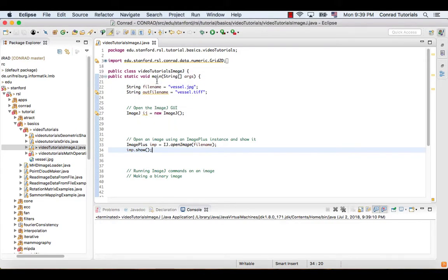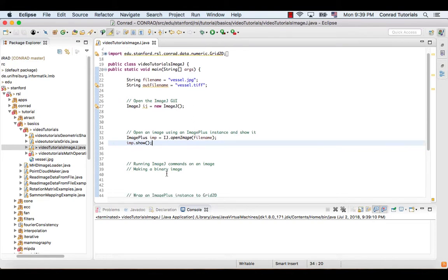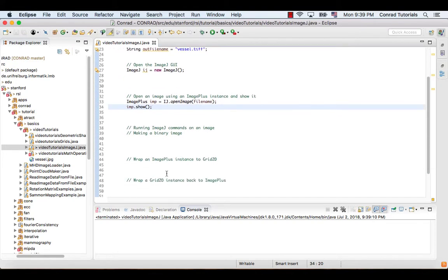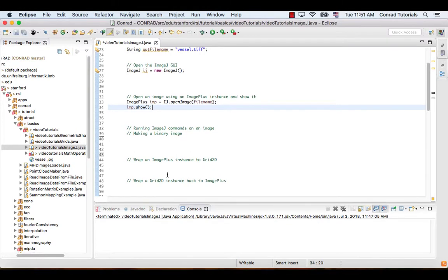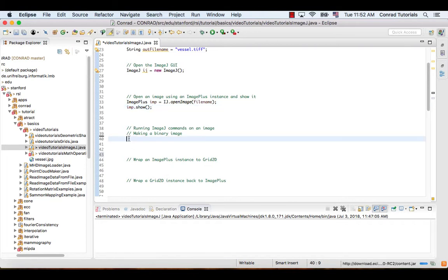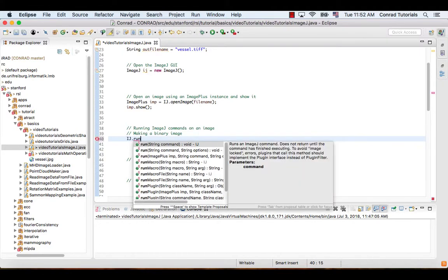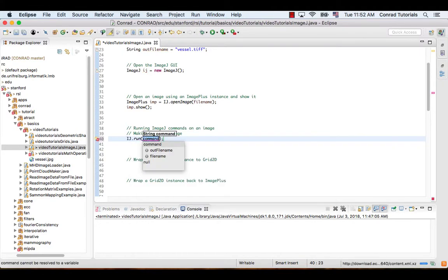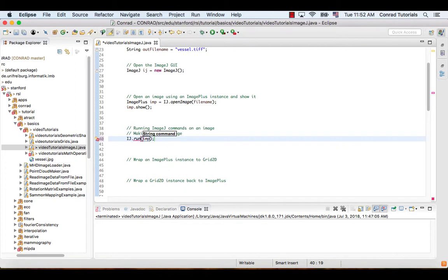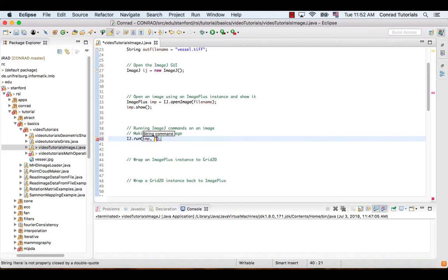We can execute ImageJ commands in Conrad. For example, we can convert the original image to a binary one by calling the function run in the class ij.IJ with the command convert to mask.